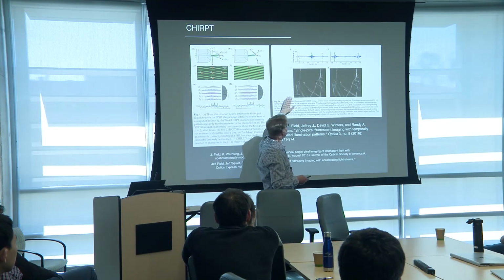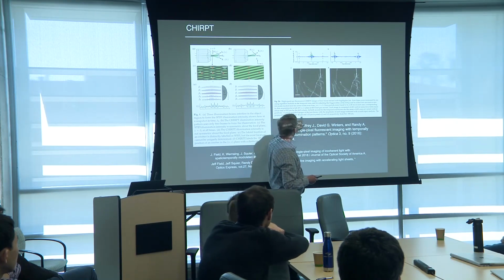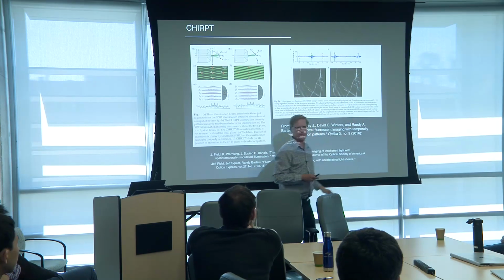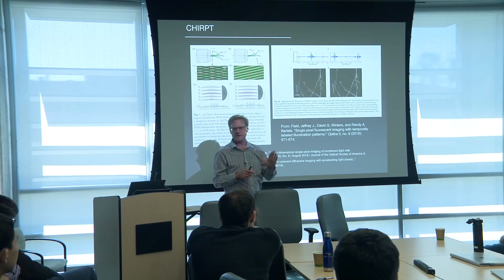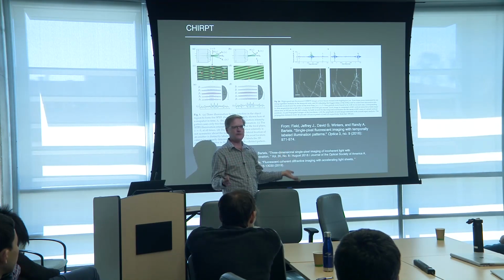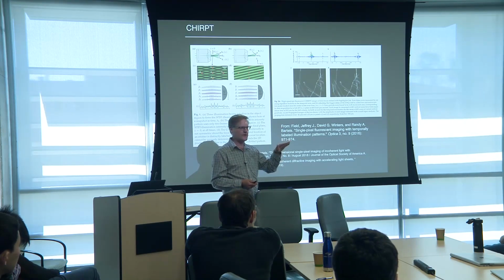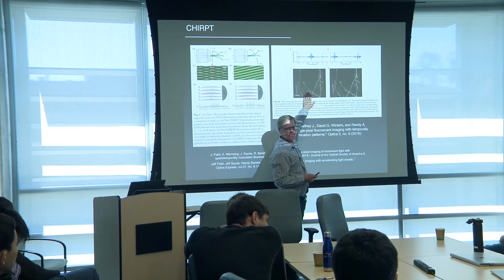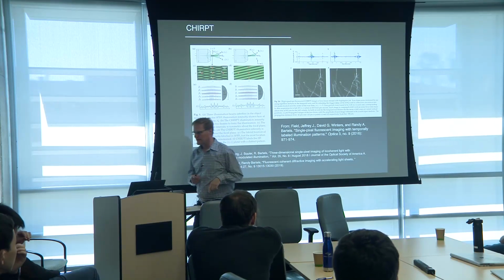And so here they are able to show that, I think this is, okay, it's right here. This is 40 microns before the focus, and this is 20 microns after focus. This is a 2D object, just to show you the example. When you're out of focus, your image should be blurred by the defocus. But because they're able to measure the phase front where the specimen is, they can just propagate through it and correct for it automatically. You can see they get really the identical image in both cases.